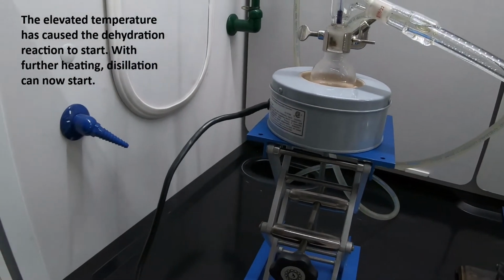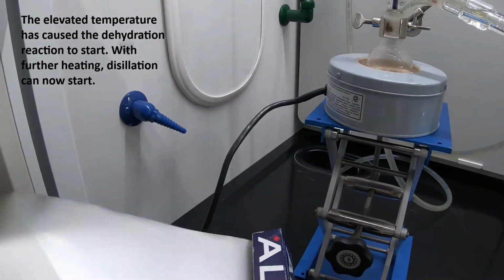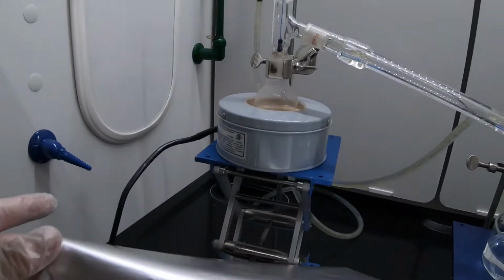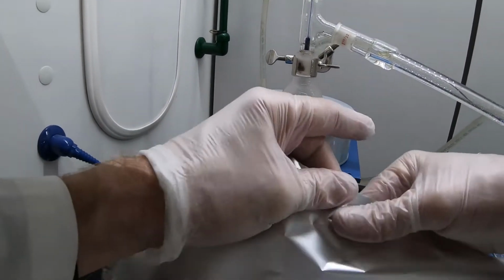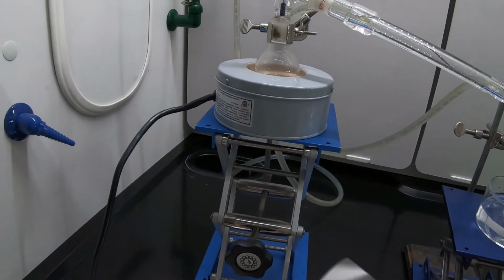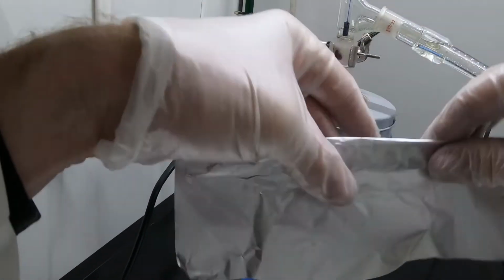At this point, I'm going to increase the heat to 90, as well as secure this area, or wrap this area with a bit of tin foil. That tin foil is effectively just a blanket. It's going to keep the warmth in, and it's going to help the system heat up or stay warmer, and then hopefully collect some of the condensate.